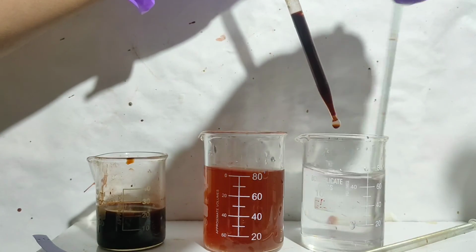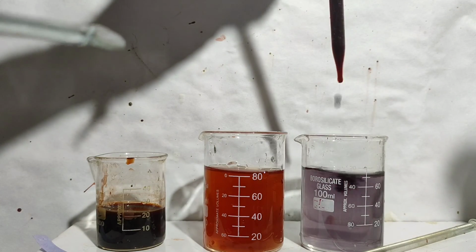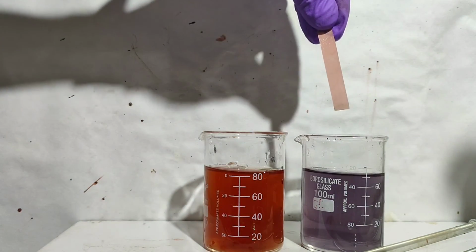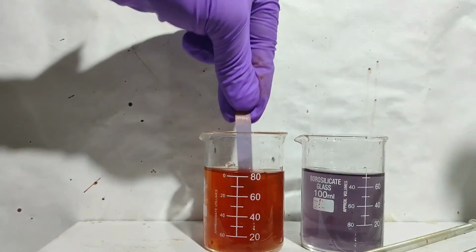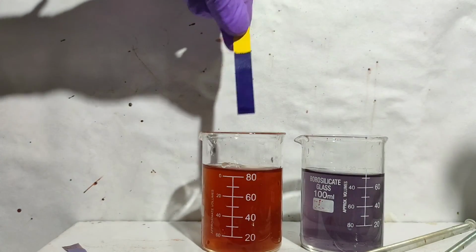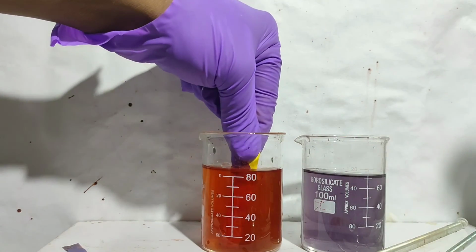The left solution turns red while the right solution turns a dark violet color. Now I took a litmus paper and dipped it in the red solution and it turns blue. And when I dip it in the blue solution, it turns red, and it turns back to blue in the red solution. The same experiment can also be performed with pH paper and it looks pretty cool, right?